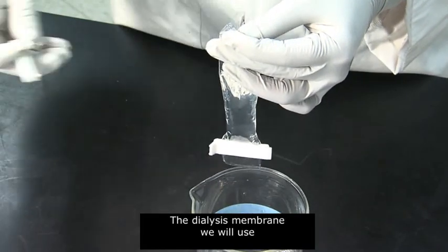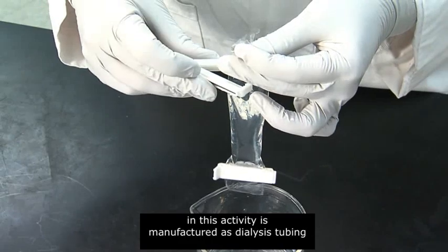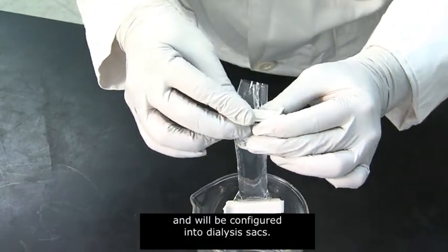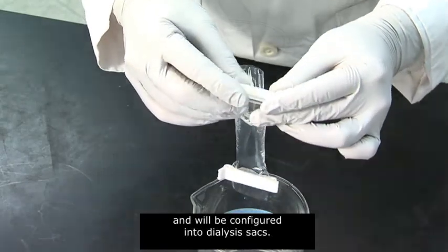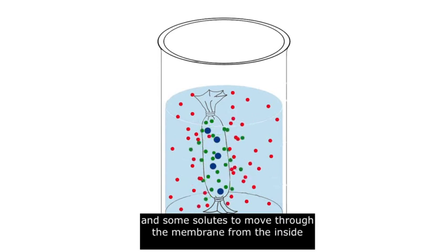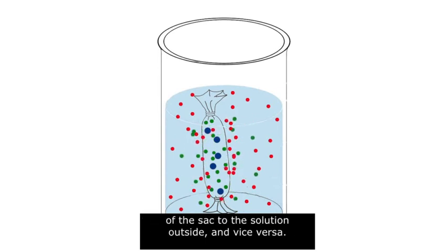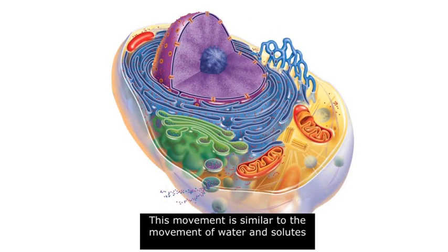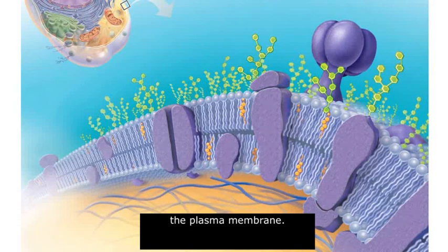The dialysis membrane we'll use in this activity is manufactured as dialysis tubing and will be configured into dialysis sacs. Dialysis tubing has microscopic pores that allow water and some solutes to move through the membrane from the inside of the sac to the solution outside, and vice versa. This movement is similar to the movement of water and solutes through a selectively permeable living membrane, the plasma membrane.